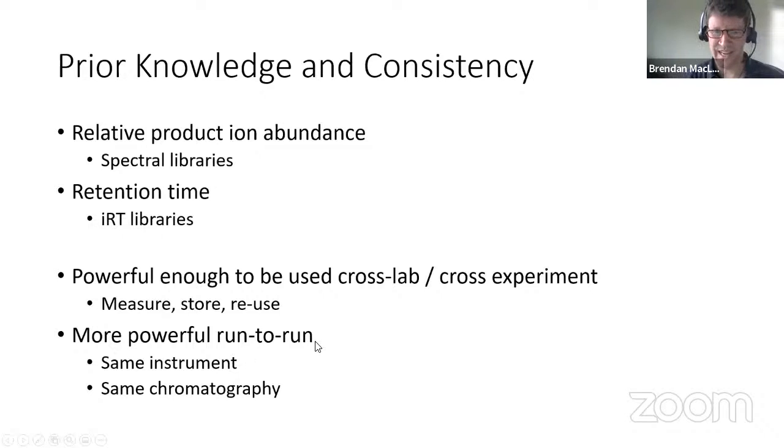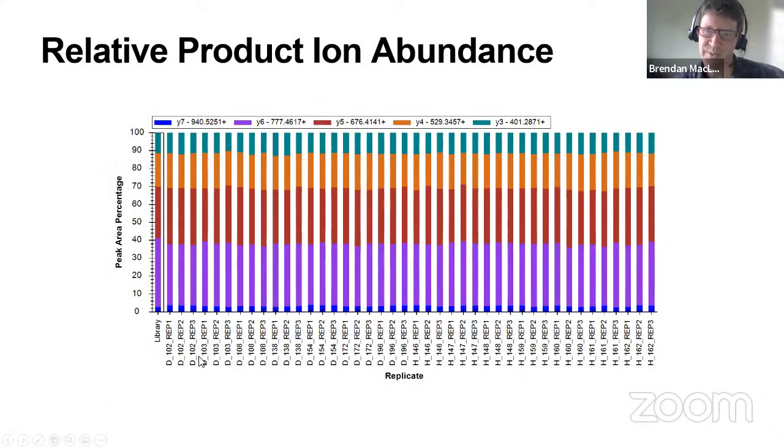So that's what we were looking at yesterday, where we could say, wow, we really expect the retention times to all line up run to run, and we really expect the relative ion abundance. That's what this looks like, again in a slide that you saw with Lindsay yesterday. This is actually the same data set. When things are working well, we see this and we go, oh, looks great. The relative ion abundance is very consistent. Each one of these colors is the extracted peak area for a certain fragment ion in an SRM experiment, and the same thing applies for DIA and even DDA.